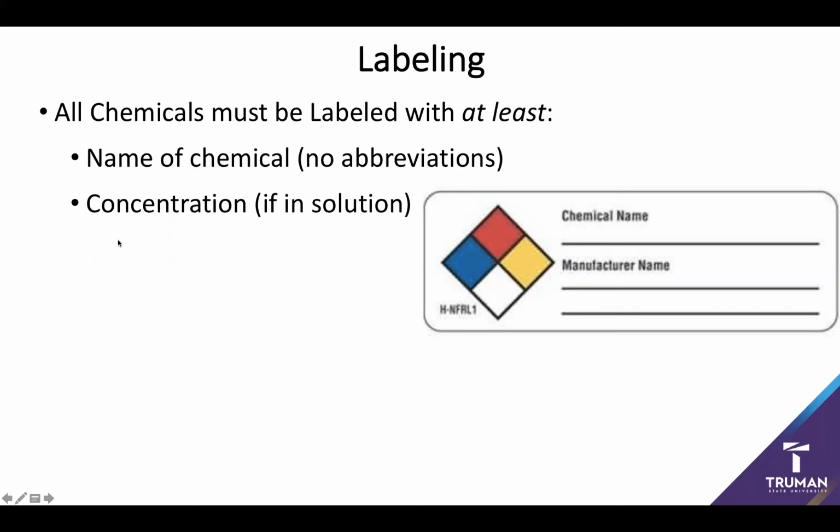So one of the things I do want to emphasize is that whenever you're using a solution, whenever you're using chemicals, make sure that all of your solutions end up in the properly labeled bottle to avoid issues like this. But one of the other things that's important to remember is that if you're putting any sort of solution, and yes, this does include water, in any sort of beaker or container, it should be labeled properly. Even if you're only keeping extra water for rinsing off glassware in a beaker, you still need to label that beaker water, because what if it isn't? What if it's something else?